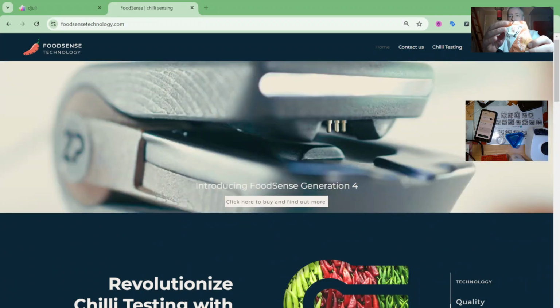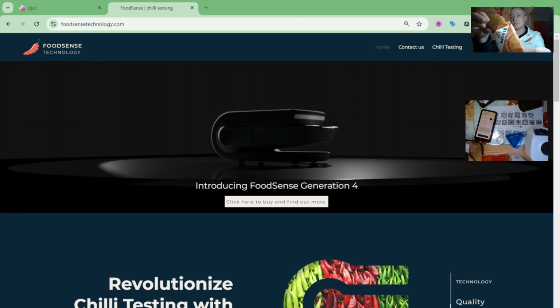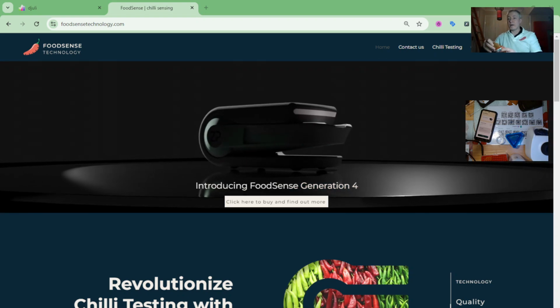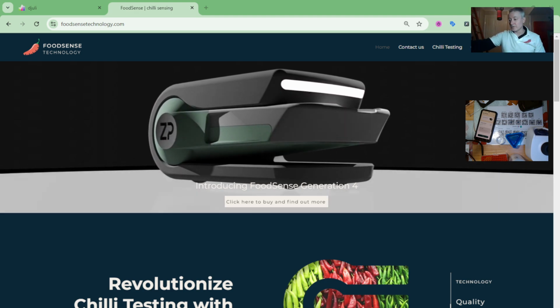I have here a ginger biscuit. This came as a pair, and I'll be measuring the gingerol in one of these ginger biscuits and essentially telling you what the pungency of the ginger biscuit is.